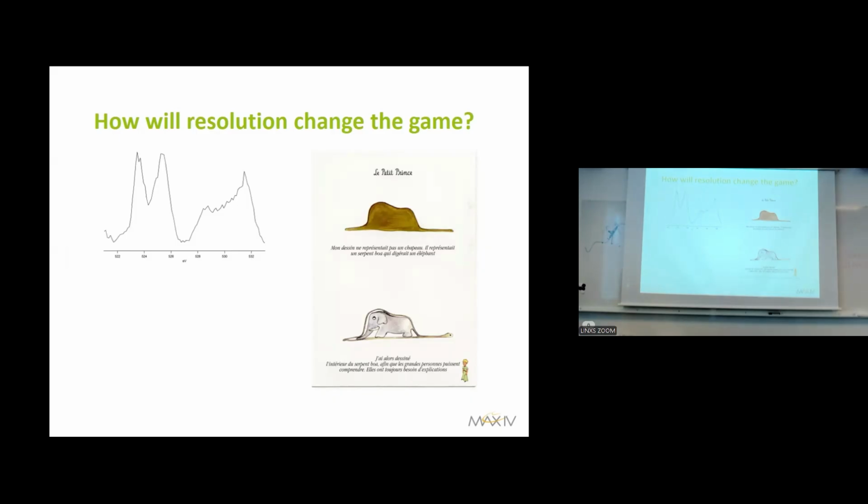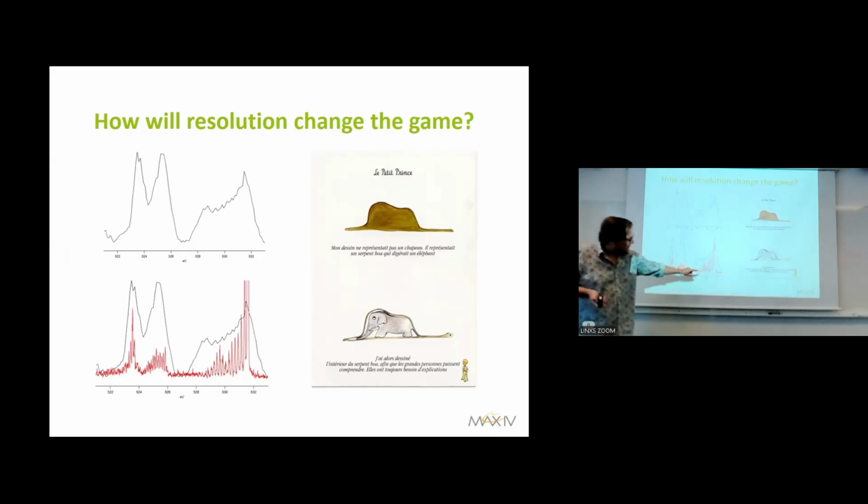Exactly what it is. And this is in fact the same spectrum measured in 2012 at the high resolution instrument, and clearly you see there's a forest of different vibrational progressions in here that would be very hard to extract properly. There's even some dynamics happening there that I don't understand. You see these lines. It's also a lot of vibrations in there that maybe weren't expected. So clearly it's worth trying to offer high resolution RIXS also to other fields outside of the quantum materials. So that's my job now, to try to convince you. And then Aniruddha will bring you back to the quantum materials tomorrow.